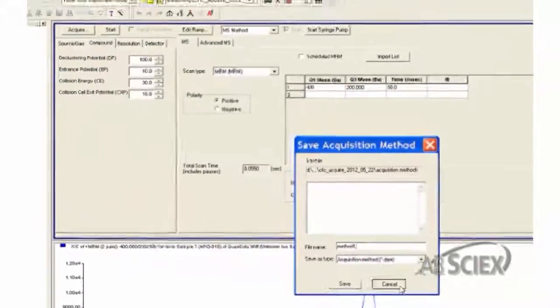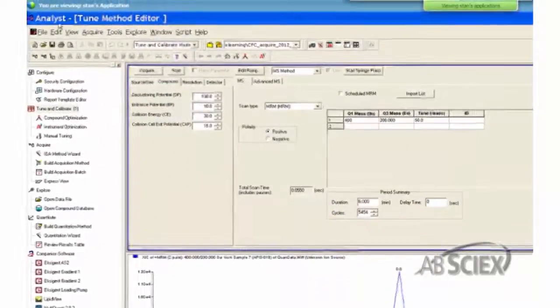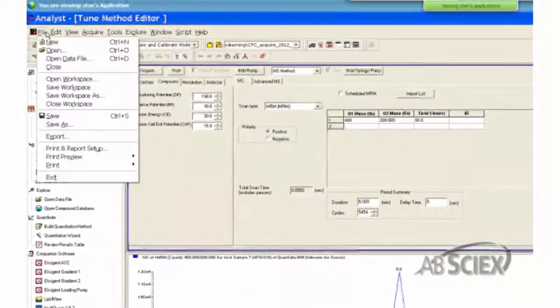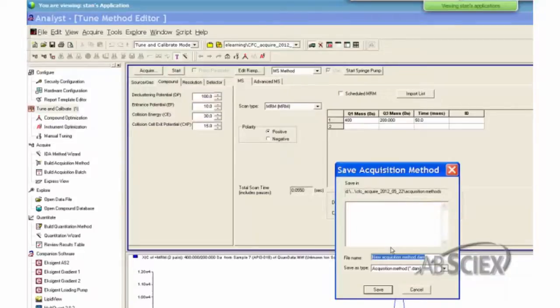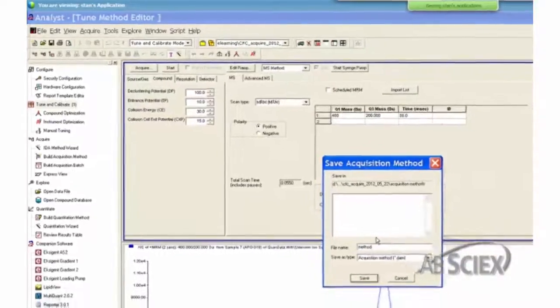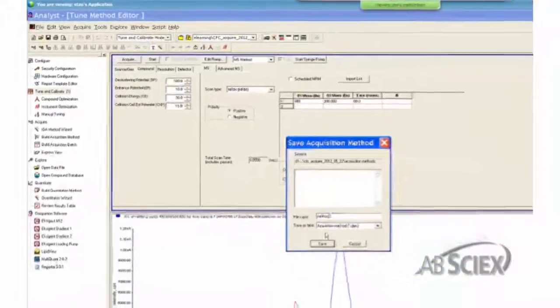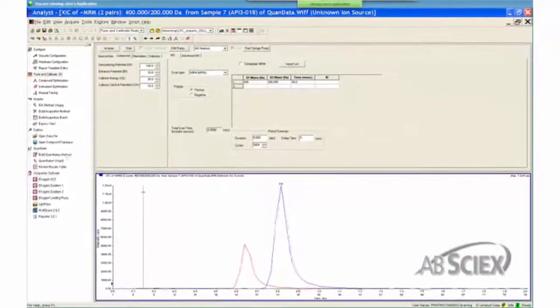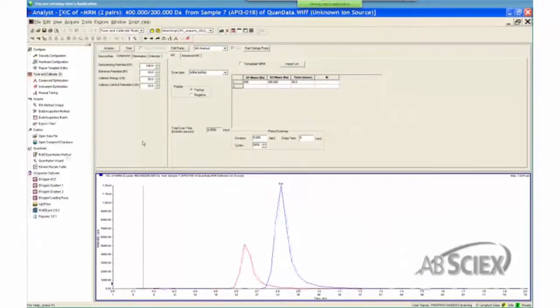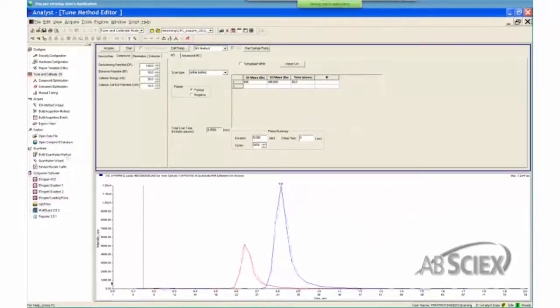The second way to save a method is to go to the file, then select Save or Save As, depending if the method is new. If a window other than the acquisition method is highlighted, then the method needs to be selected, then saved.